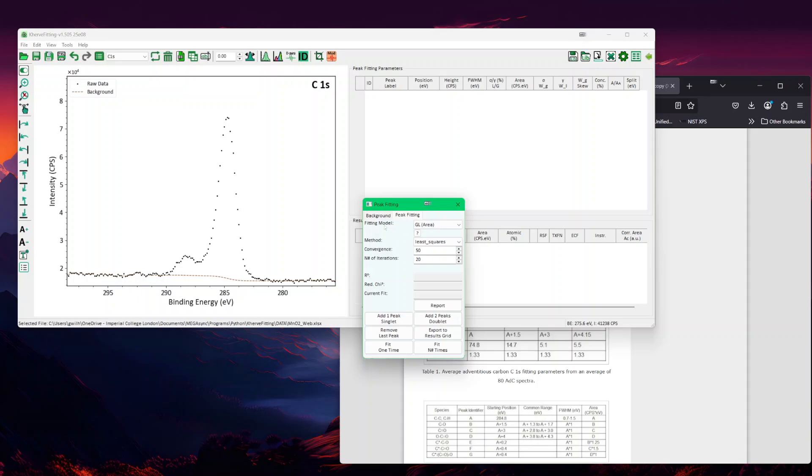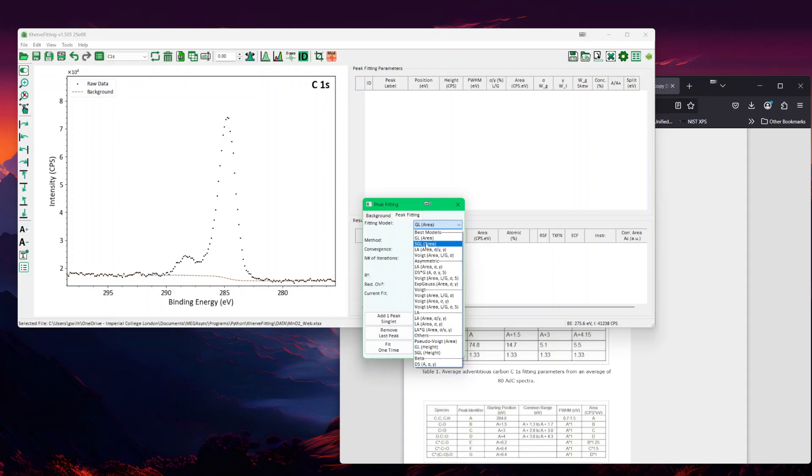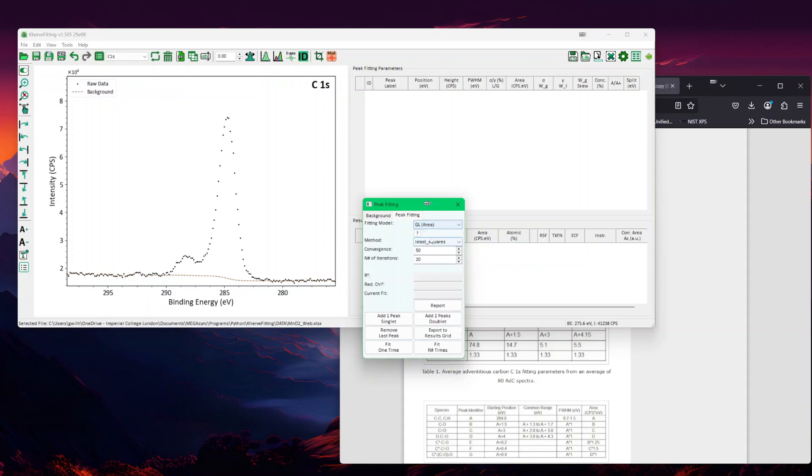Then now we come to the peak fitting. Here we have the fitting models and we have lots of different models available, but the best models are shown here. By default, the GL model, which is the simplest model but not the most accurate one. I would suggest to use the Voigt model or something extremely similar, which is simpler, the SGL, the summation of Gaussian to Lorentzian. We would start to show you the difference. I would start with the GL. Because it's a nest, we should not be adding doublet.